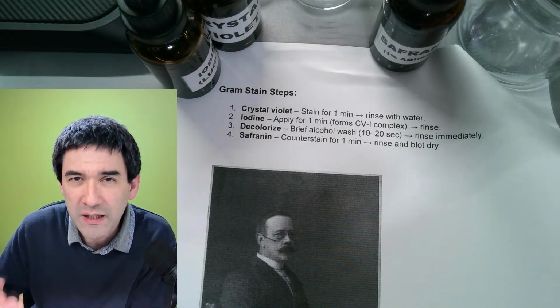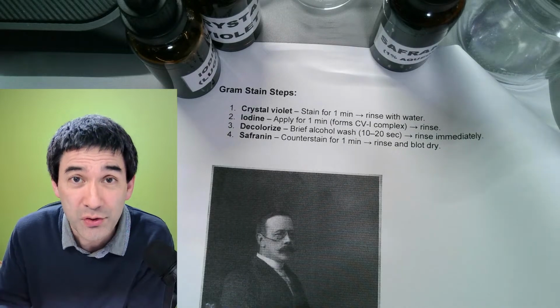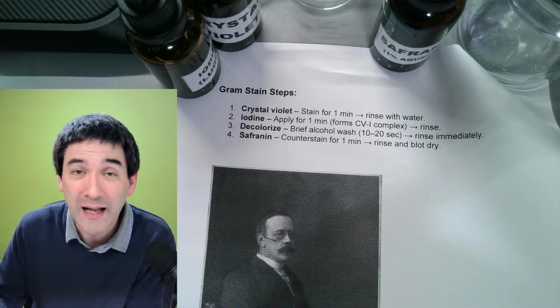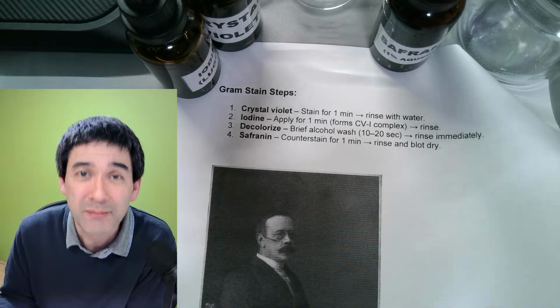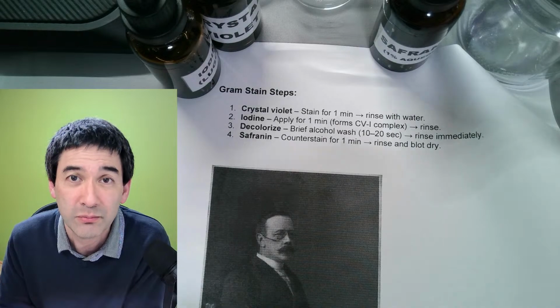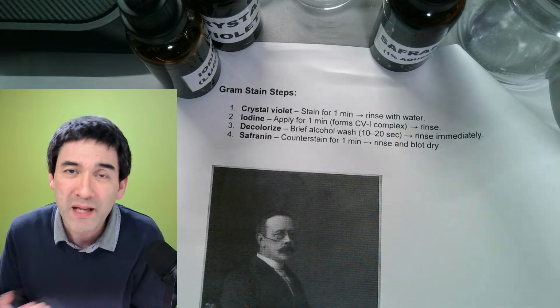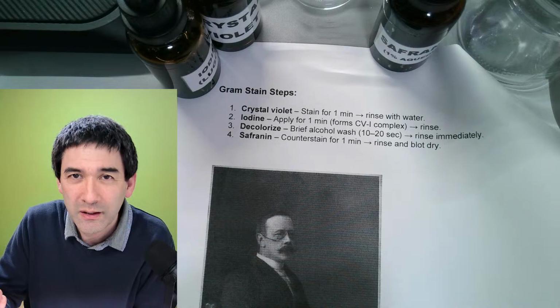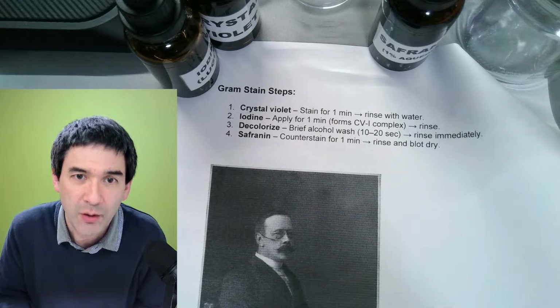But the problem is if you take a lung or any other body tissue with bacteria and put it under the microscope, you're not able to see the bacteria because there are so many body cells that will cover them up. From the proportion, there are simply many more body cells, and the few bacteria that you find there are generally not visible. So he tried to develop a staining method, the gram staining, which allows doctors to contrast the bacteria and see them better in comparison to the remaining body tissue. And that's basically how it was developed.